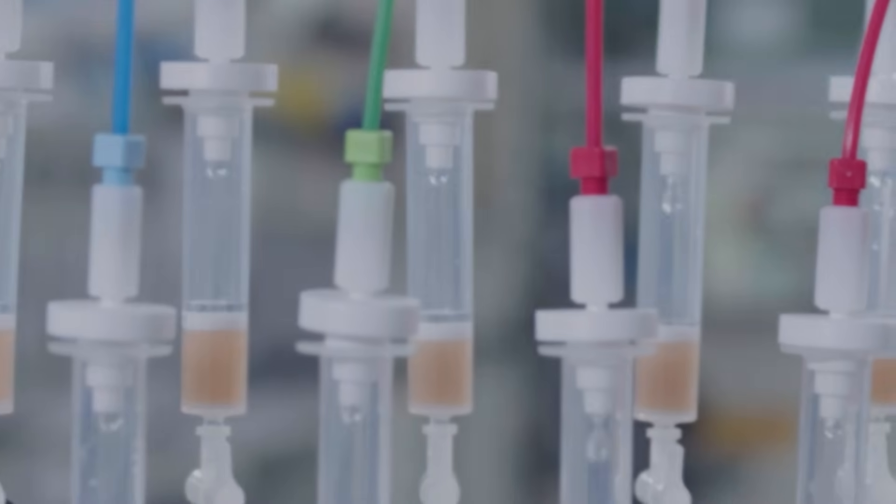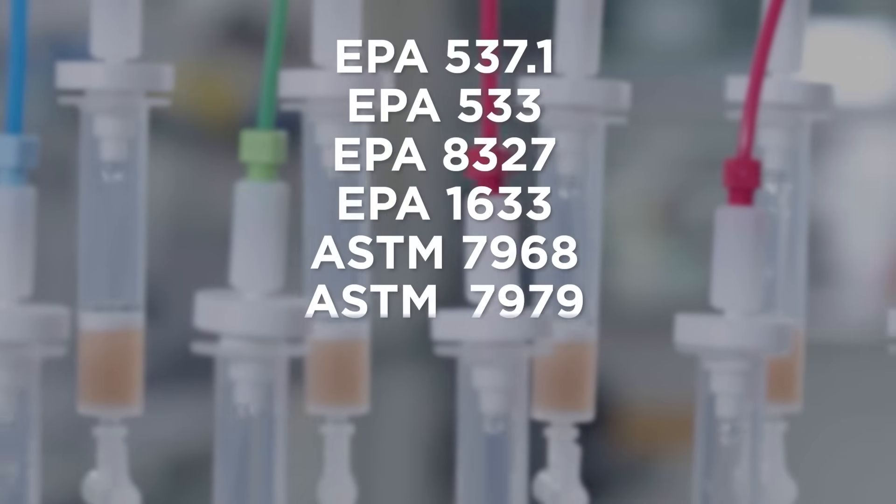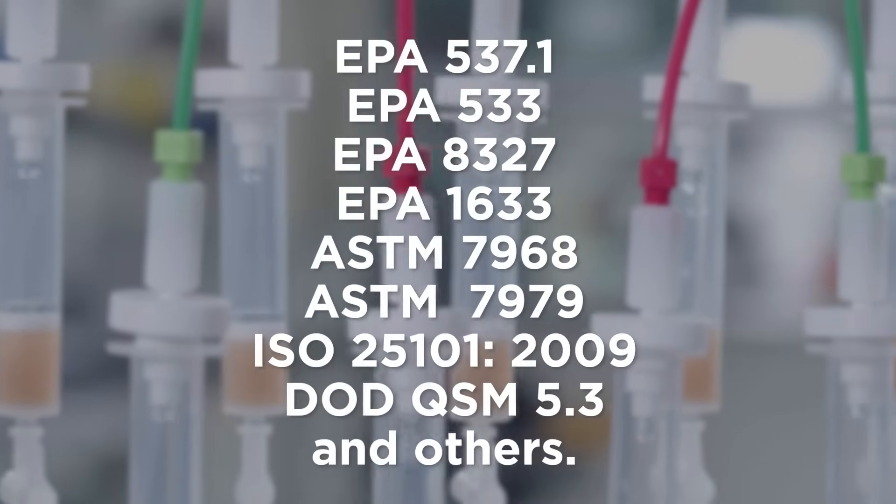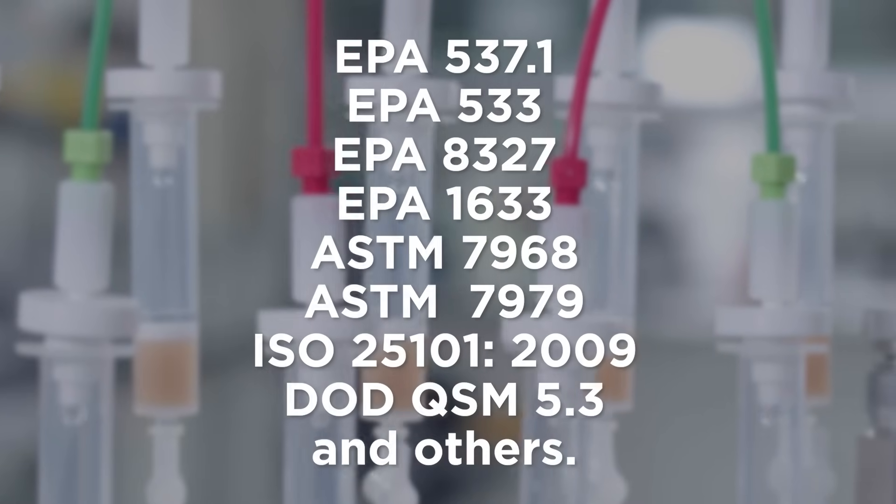PFOS methods such as EPA 537.1, EPA 533, EPA 1633, and many others.